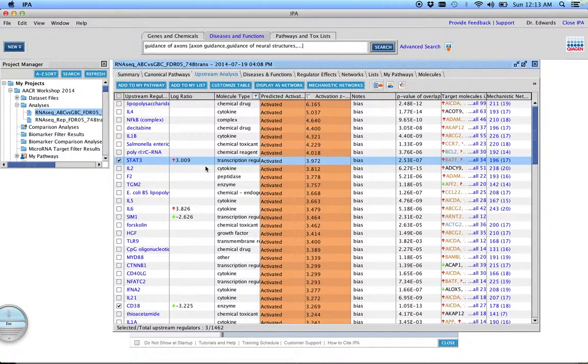You also have things that are secreted by other tissues that you would never see. This allows you to attempt to get at this. And I would say that IPA is one of the few software systems that really exploit this type of analysis. And I think it's very, very important. This is almost like the skeleton of your transcriptome. You can go to regulatory effects.